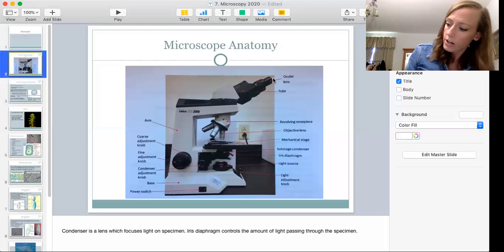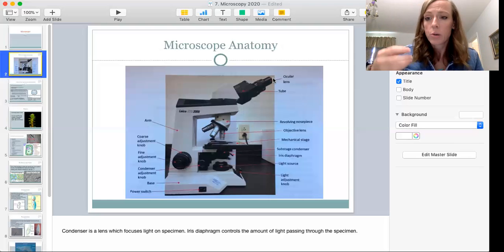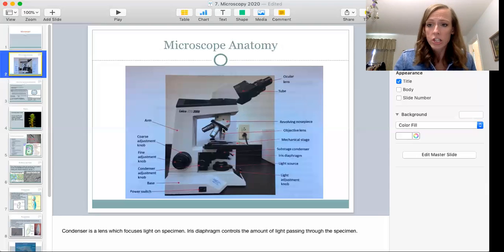You actually put your head to the side and look at what you're doing to bring them together first. Then when you need to look through the eyepiece, you can draw the stage away from the objective lens by turning the adjustment knob the opposite direction. This avoids any potential cracking of our slides, which are not cheap. So that's how you bring your specimen into focus.